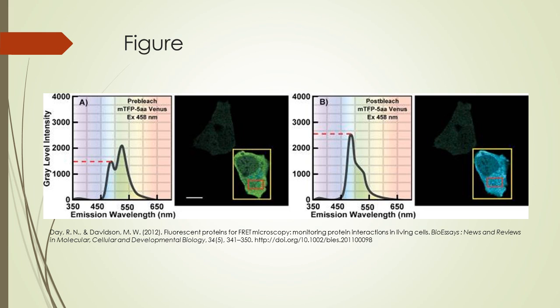In this experiment, they discussed the selection of FPs for different FRET methods, identifying the most useful FP candidate for FRET microscopy. The recent success in the expansion of the FP color palette offered the opportunity to explore new FRET pairings between the FRET and FP.